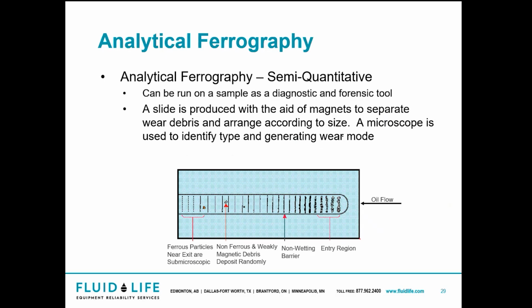So, analytical ferrography. My background is actually metallurgy, so I could do a whole course on analytical ferrography on its own. Maybe I will at some point do one of these webinar series just on analytical ferrography. It's a semi-quantitative test and can be run on a sample as a diagnostic and forensic tool. A slide gets produced with the aid of magnets to separate wear debris and arrange it according to size. A microscope is used to identify the type and the generating wear mode.